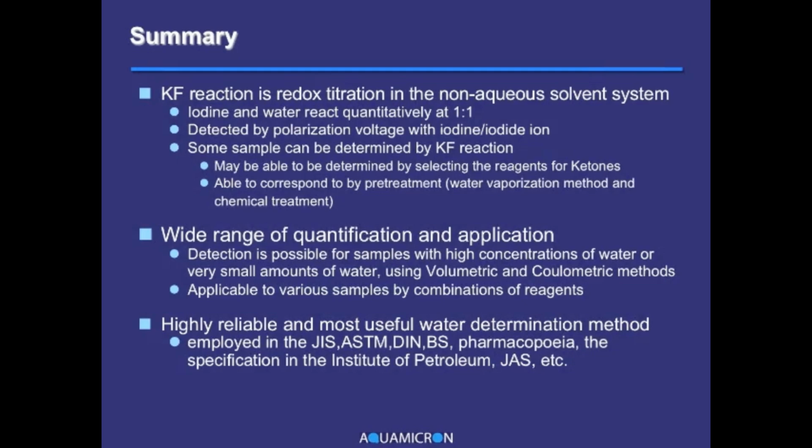Let me summarize this presentation as follows. First, the Karl-Fischer titration is an oxidation-reduction titration in non-aqueous solvents. Iodine and water react quantitatively, 1 mole to 1 mole, in this reaction. The change of the polarizing potential can be detected due to the reaction between iodine and iodide anions.